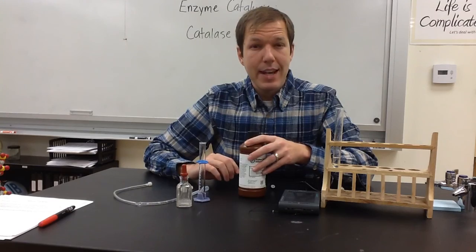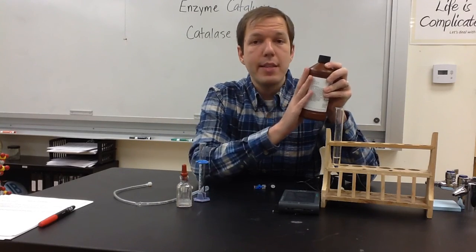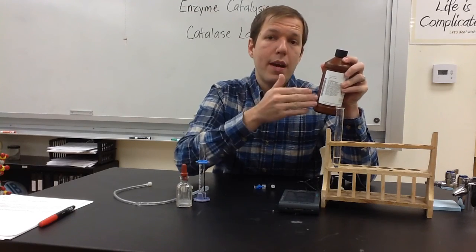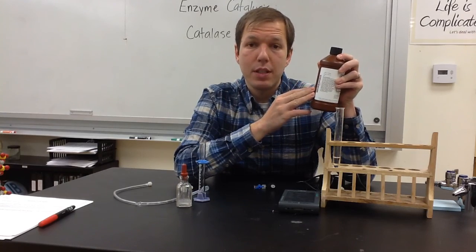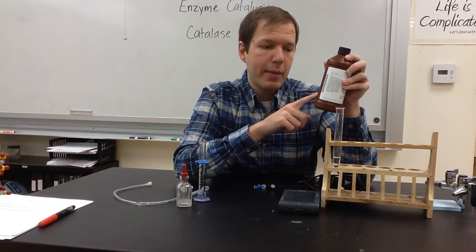One thing to remember about peroxide is that even though in our cells an enzyme is used to catalyze this decomposition, it will decompose on its own. So it's in this brown bottle because light is going to impact the rate at which this is broken down. As this is exposed to light, some of that peroxide will on its own break down without an enzyme.